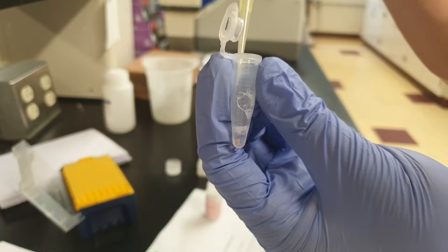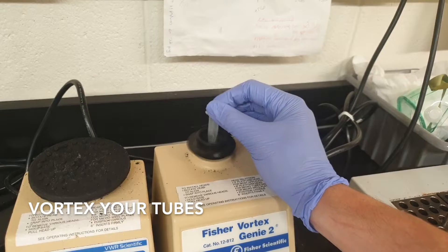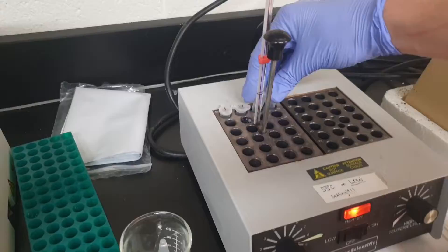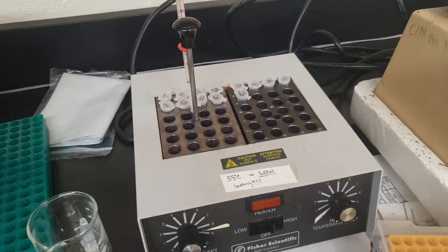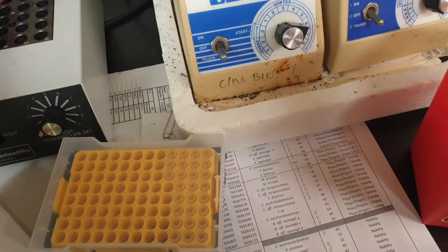Now this is going to start the lysis process. Vortex your tubes, then put your tissues on a hot plate at 56 degrees Celsius for about 2 to 12 hours. If you can, vortex your tubes once every hour.